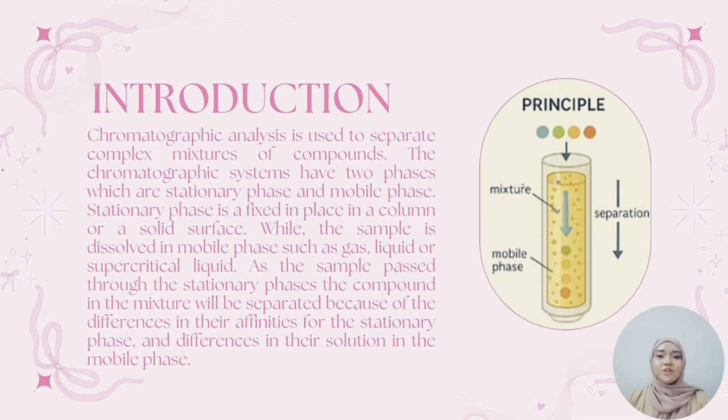So today we would like to share about gas chromatography. This is an introduction. Basically, chromatographic analysis is used to separate complex mixtures of compounds.